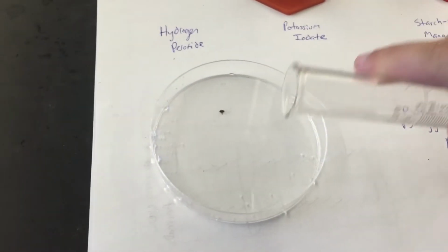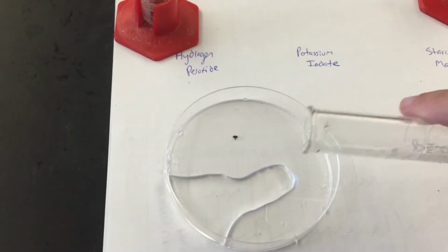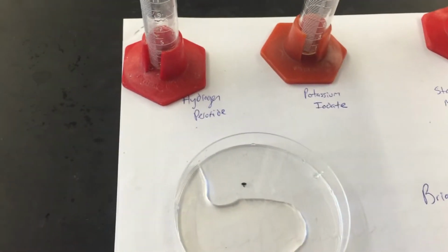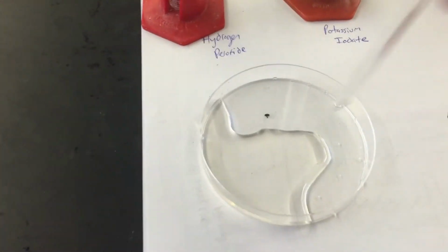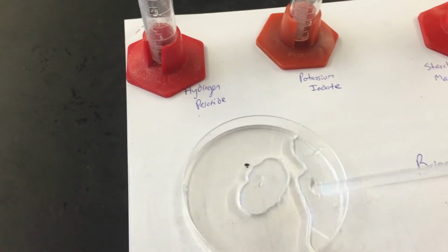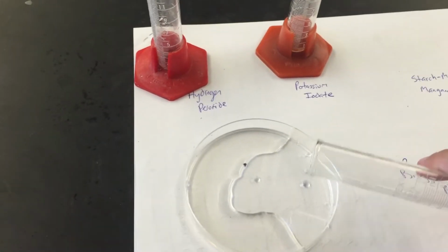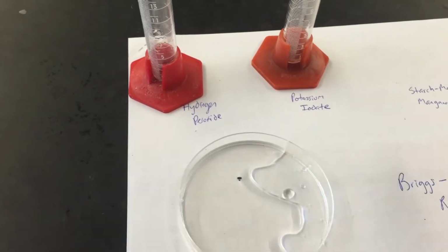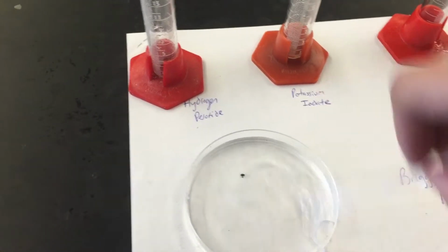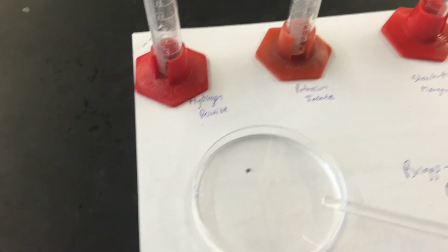So I'm going to mix my hydrogen peroxide first in the bottom here, and I'm going to have to mix them together while I do this. I'll add my potassium iodate. And actually, I should probably stir it around a little bit to get that mixed up. And then I'll add my starch malonic acid like this as well. Just mix it around, get it all nice and ready to go.